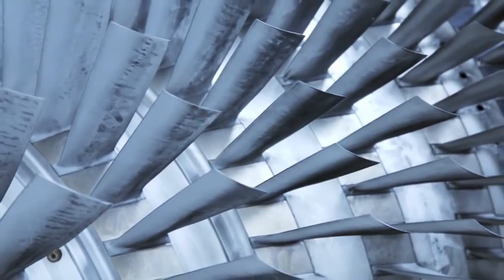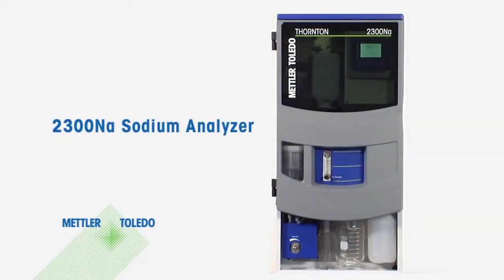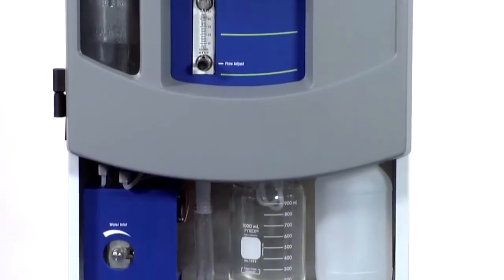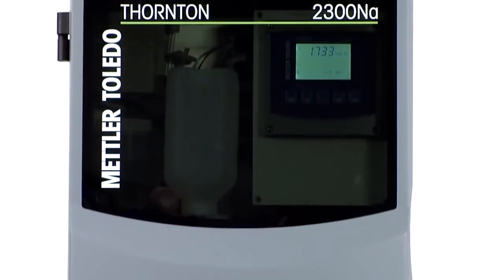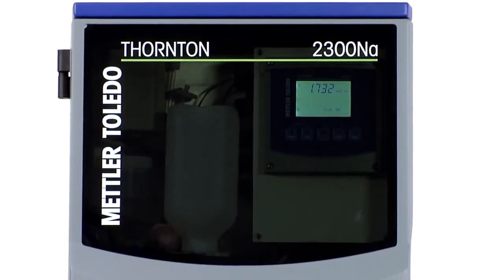which can lead to major turbine damage. The new Mettler Toledo Thornton 2300NA sodium analyzer provides efficient and reliable monitoring of low sodium concentrations for these applications. It uses industry-proven technology, but with innovative approaches that simplify calibration and improve measurement reliability.